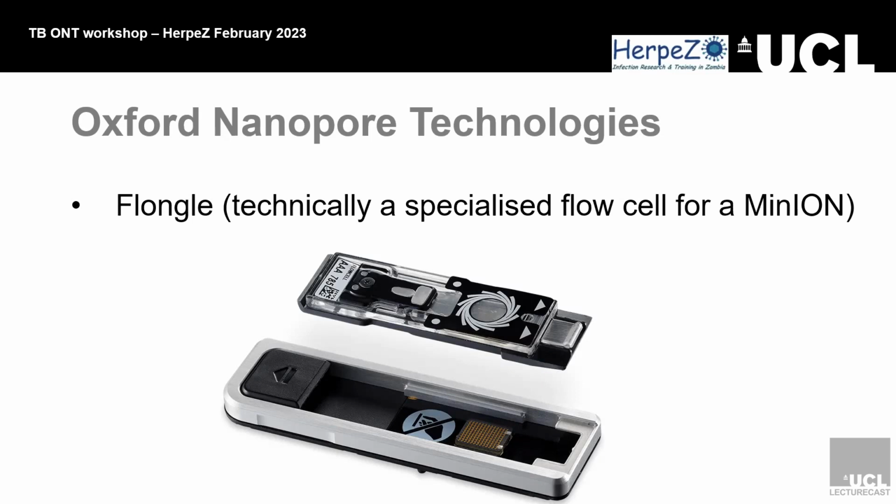You get kits and flow cells with that as a starter pack. Considering one flow cell is I think £800 now, maybe $850, it's pretty good value, really. The whole thing is $1,000. If you're buying flow cells on their own after that, it will cost you $1,000 for one.